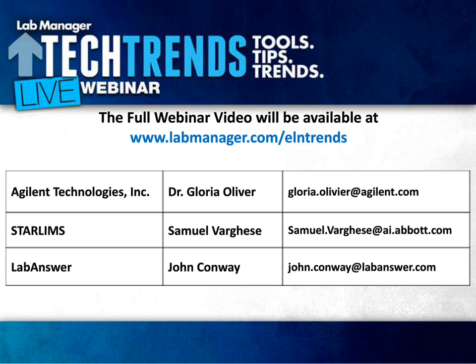Great, thank you. Gloria or Sam, anything to add to that? I absolutely agree with the idea of taking it for a test drive. I think that's really where you're going to see the differences between different vendors. So I think the opportunity to try it out in your laboratory for a month or two, however long it takes for you to evaluate the functionality and get a sense for what it's going to be like using the product on a daily basis.